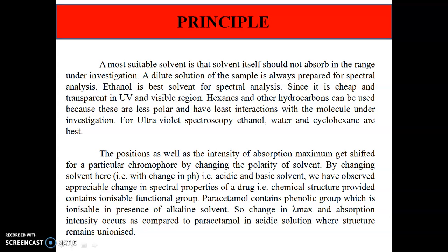Polar solvents do not form hydrogen bonds as readily with the excited state of a polar molecule as with its ground state, and the polar solvent increases the energy of the electronic transition in the molecule. A polar solvent shifts the transition of the n to pi antibonding type to a shorter wavelength.